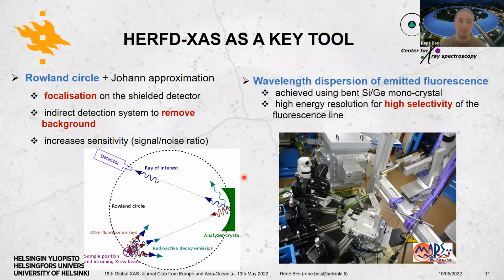You mean to set up good resolution? Setting up is not taking much. Well, it depends on the beamline and how many crystals you have, but typically it's a matter of a few hours at maximum if you have to realign everything from scratch. Most of the time, when you have aligned it once, it should be okay. You just have to check that the new sample is at the focal point here, and that's it.